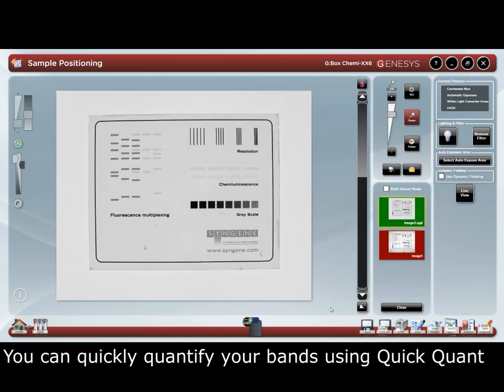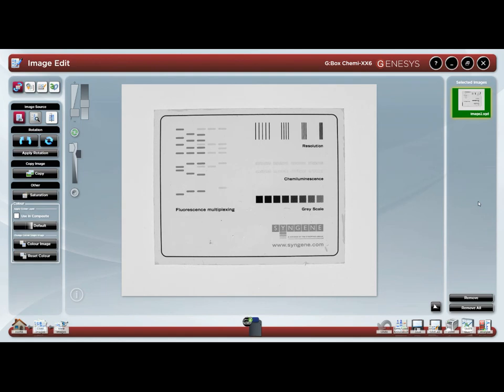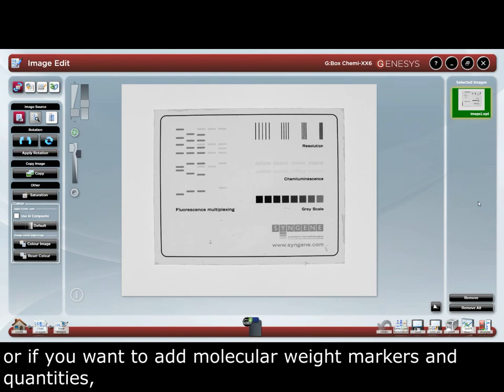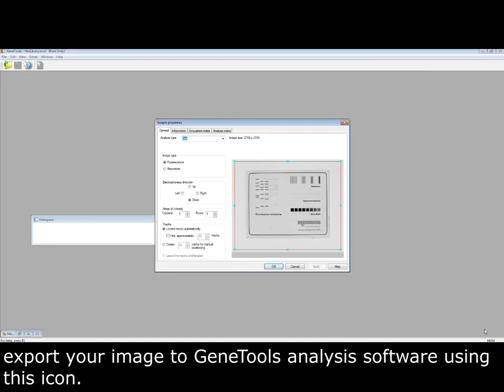You can quickly quantify your bands using QuickQuant. Or if you want to add molecular weight markers and quantities, export your image to GeneTools analysis software using this icon.